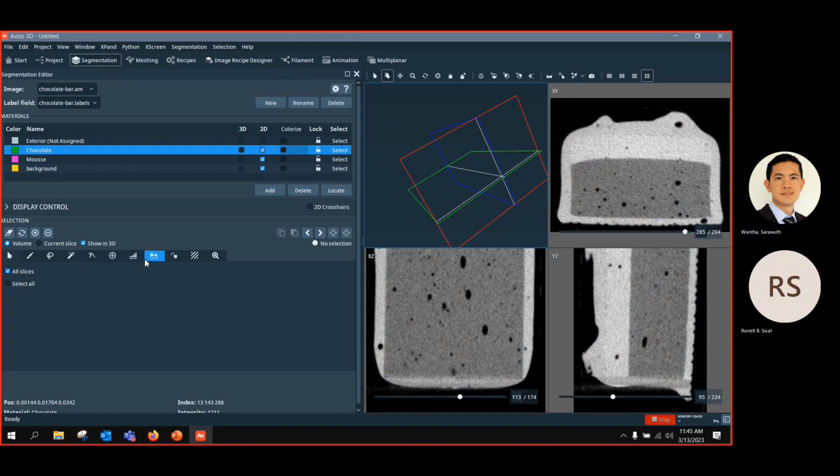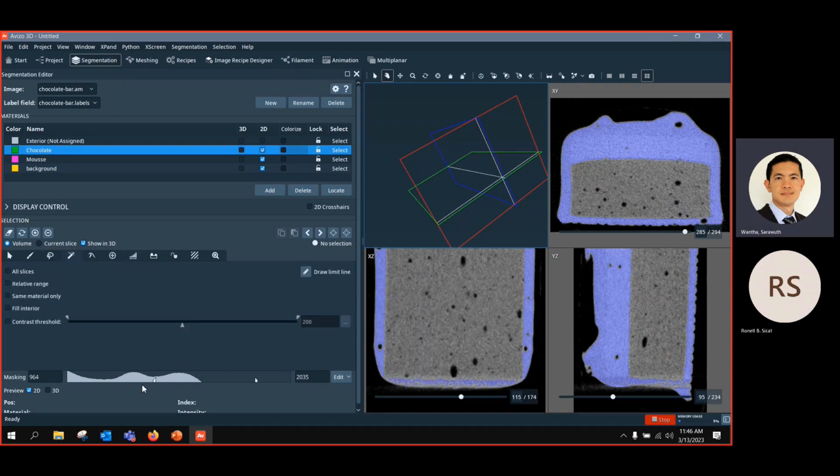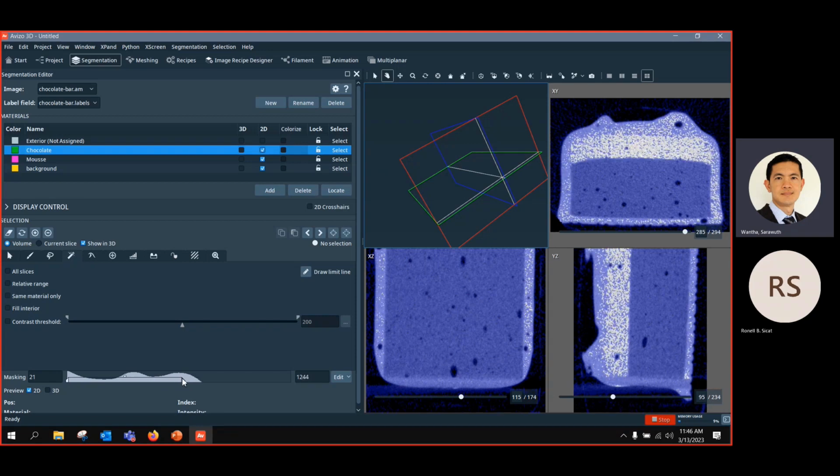I already showed you this threshold tool. It's exactly like the automatic tool, but in combination with the segmentation room. We also have a similar tool called magic wand. In this example it might not be a good idea to show, but it uses the same principle of threshold. You have to create the mask, and then we need region growing, so it will only detect connected regions.